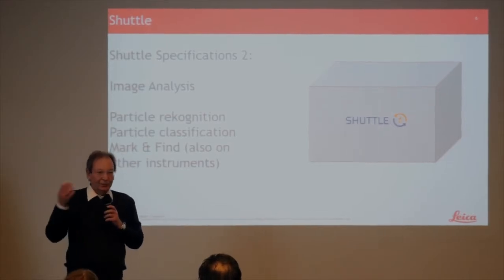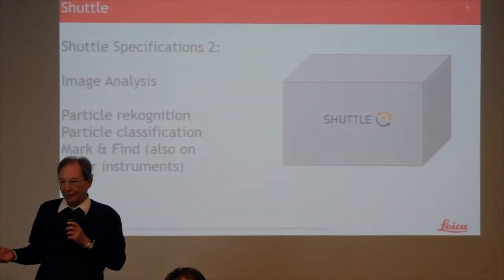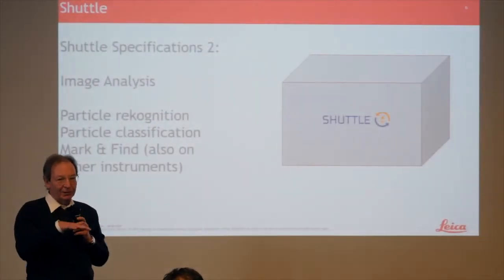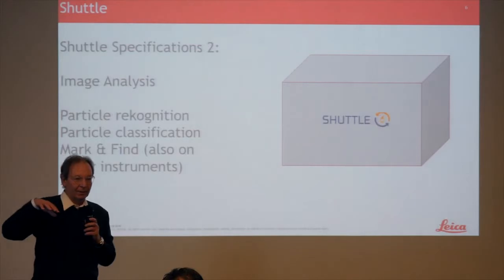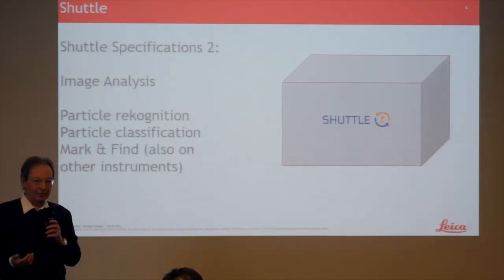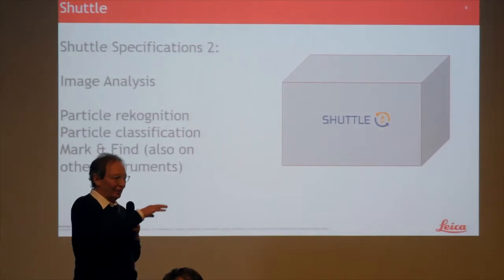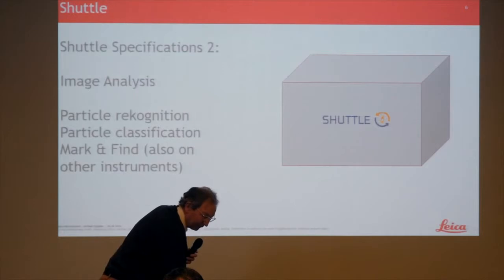And then there is also that request to refine the particle. On an A4 scale, you would have to put your sample in exactly the same position so that the scanning stage could go back to that particle of which we know the coordinates. So that has other technical implications. It also has technical implications in terms of the scanning stage used. At the moment, there is no scanning stage that comes to my mind with a high enough precision of what you need if you want to find your small particles again that can cover an A4. So another obstacle.